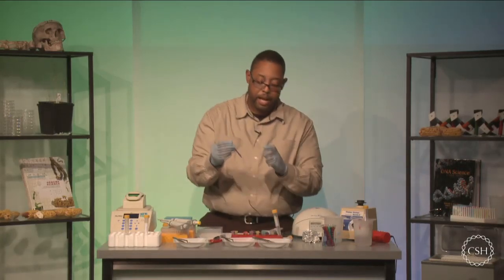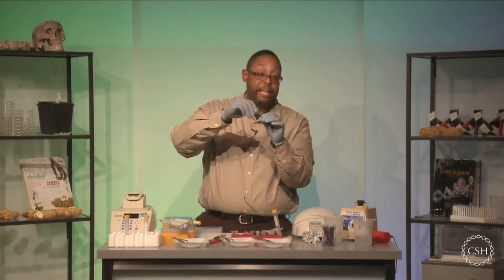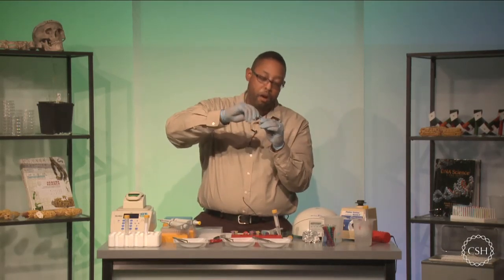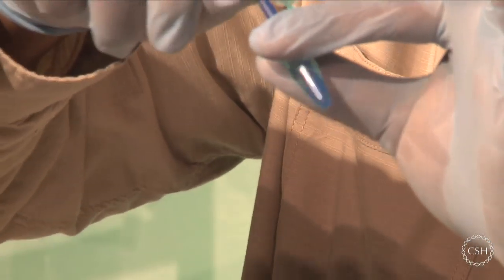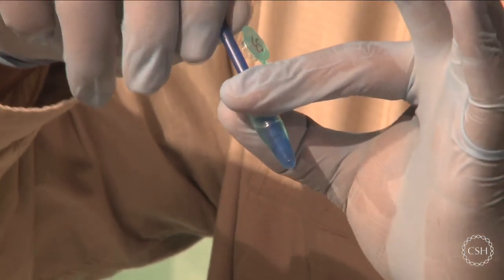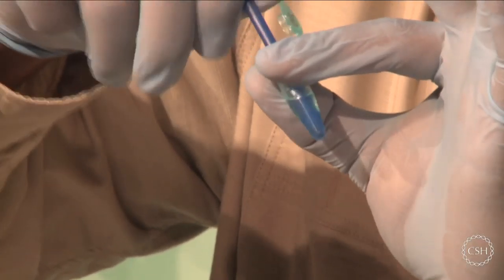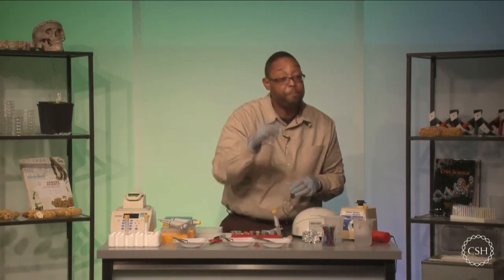So I'm going to do my insect last. The insect legs like to float, so please make sure you push all the legs down to the bottom and then press really hard and grind. Please make sure that you break up the insect leg rather well because the exoskeleton is a little rough. And once you can see that it's broken up pretty well, you can stop and then move on to the next individual step. I'll take this and push this down.